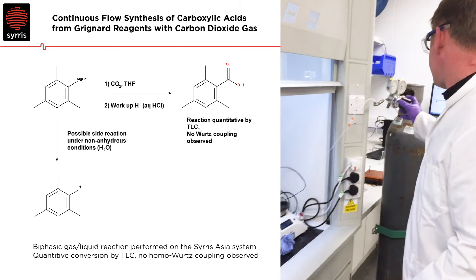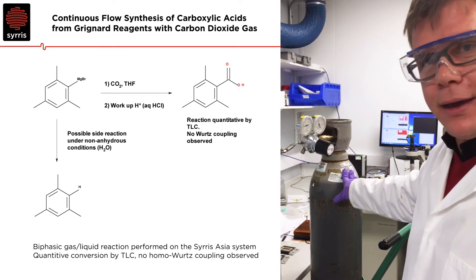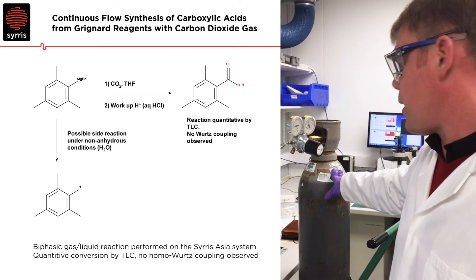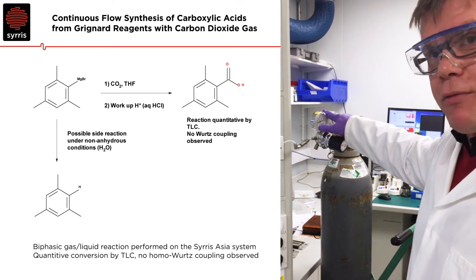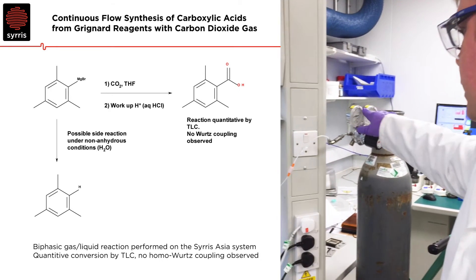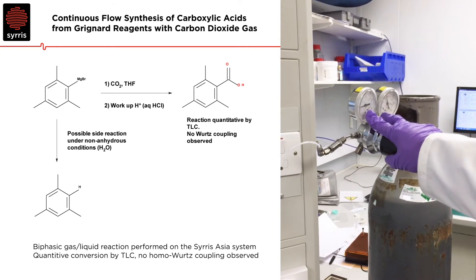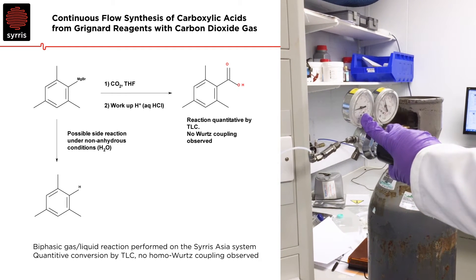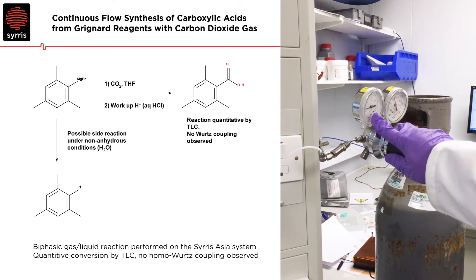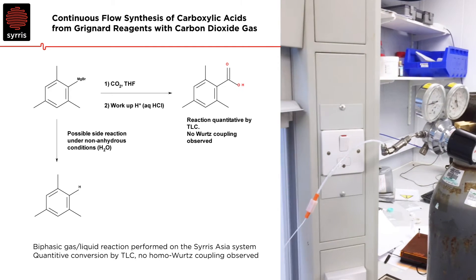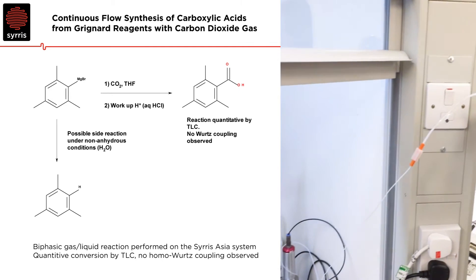So you can see the setup that we have here is directly from a carbon dioxide cylinder. We have a pressure regulator, and this has quite fine control to allow us to control in detail with good resolution the differential between our system pressure and our gas pressure.